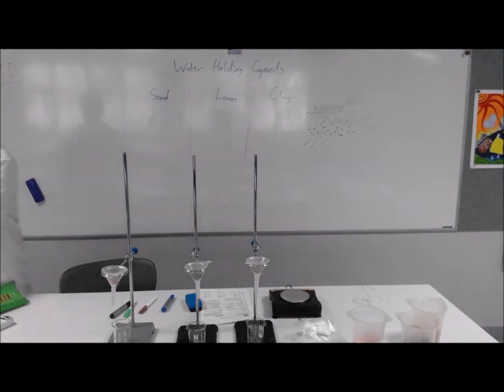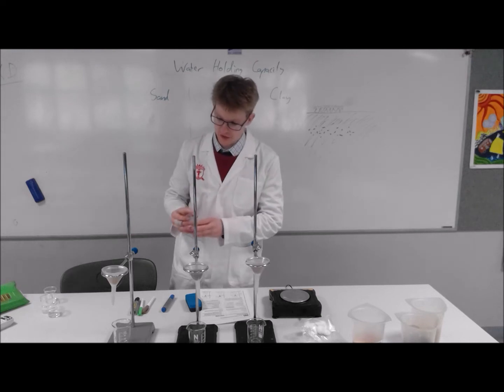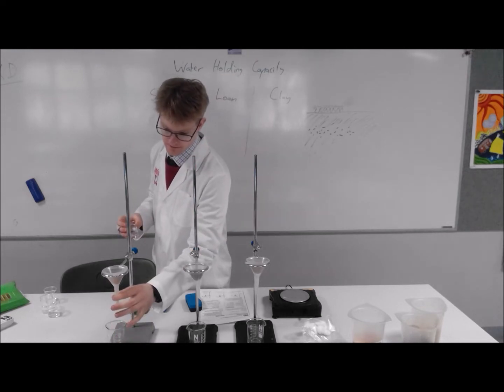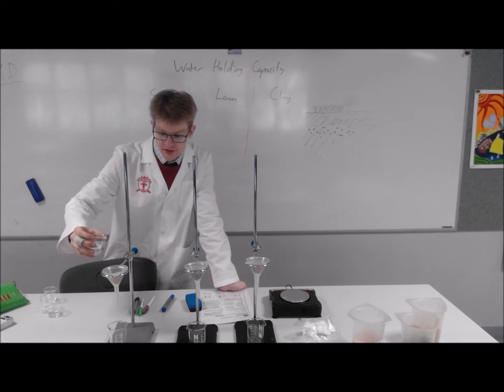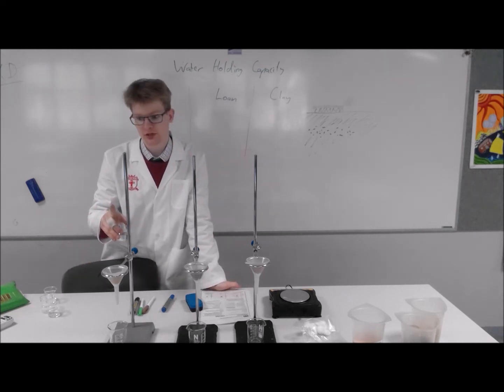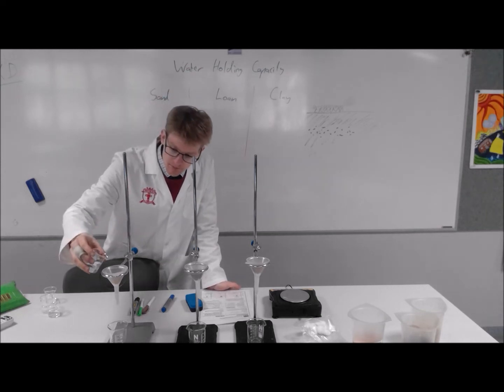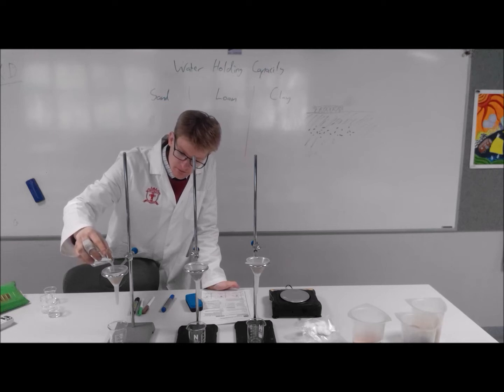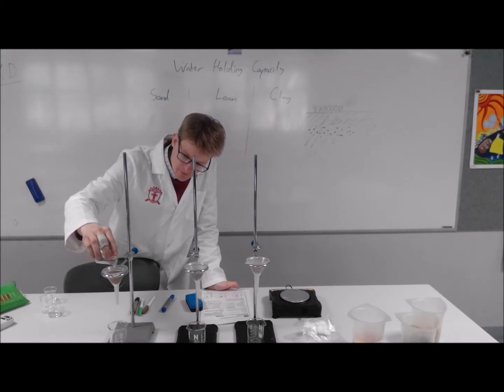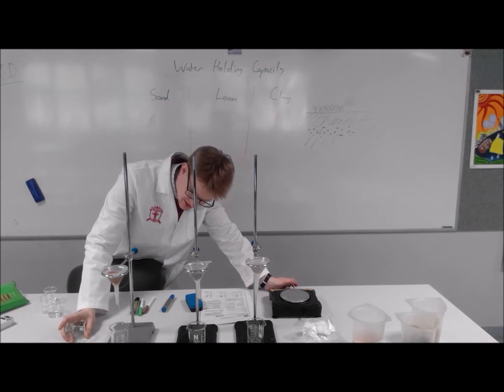All right. So I'm going to fill this beaker up. Okay. I have 20 mils of water here. I'm first going to pour it into the sand. All right. Let's see how much water will fall through. By the way, the method to this can actually be found in your textbooks on page 98. All right. Oh, there's a bit coming out. It's not a heap.